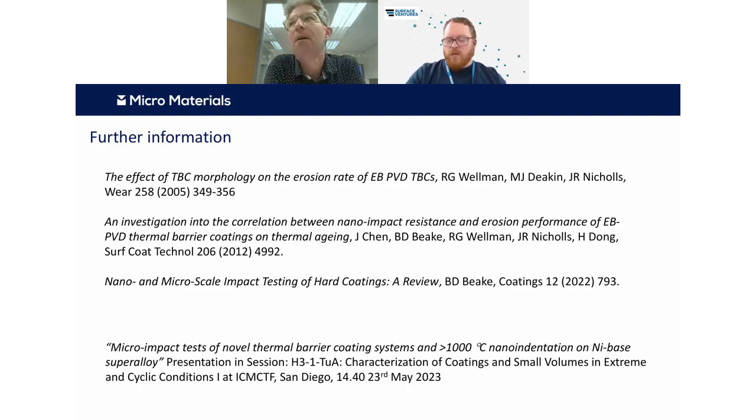I mean, first, and just said thank you for the response. It might be that for the glasses that we looked at the beginning, the rectangular seemed to be very informative as well. So I wouldn't like to say, I guess. Just curious about the rectangular. I wonder how much can be gleaned by looking at, for different materials, the impact spacing, because there's quite interesting crack morphologies that occur depending upon the spacing. So yeah, I touched on that, didn't I, with the laser scanning confocal, and I only really showed in detail the fused silica. But there's a lot of information there in terms of how these things join up. There seems to be almost like a critical threshold, I guess.